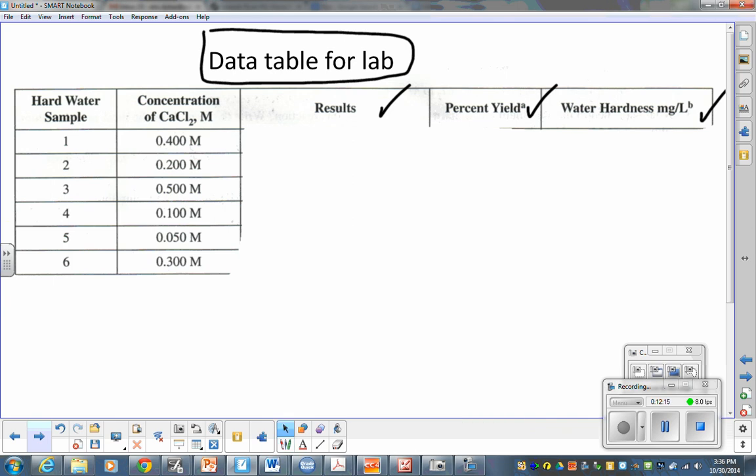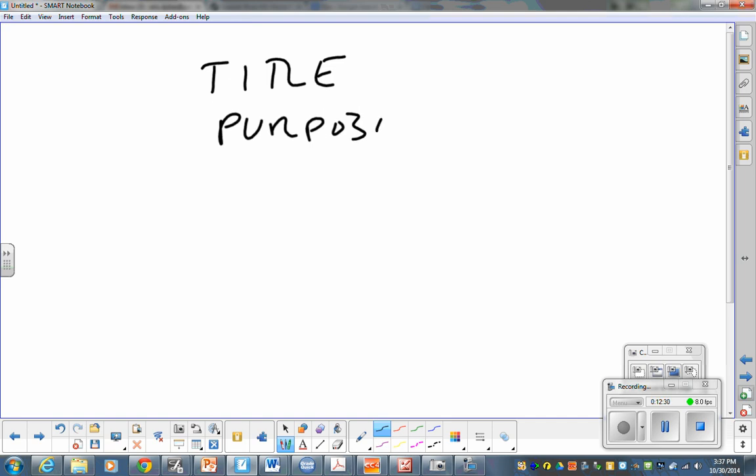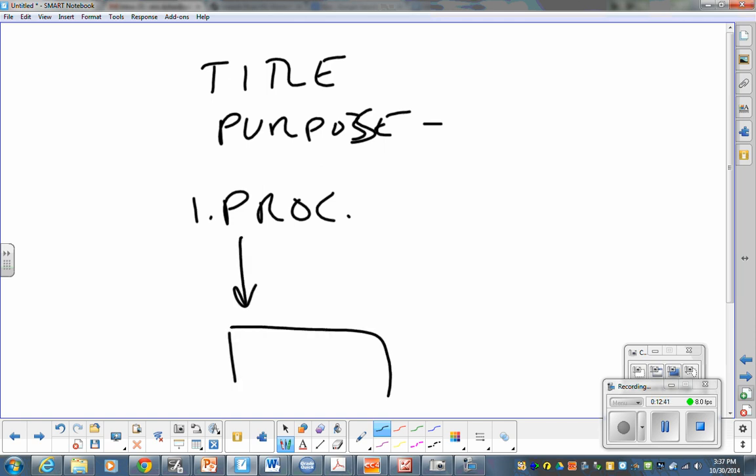So when we go to do our lab book, key things you want to set up for tomorrow: you'd obviously have your title. You would have your purpose, which based on this video, you should be able to explain what the whole thing is that we're doing. You are creating a modified procedure based on what I described, numbered, and then you'll have your first table of calculated pre-lab values. You'll scan it, upload it into Turnitin.com and bring it with you. And then just past that, you'll create a data table for the lab when we actually do it tomorrow.